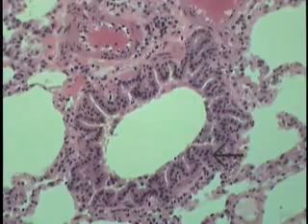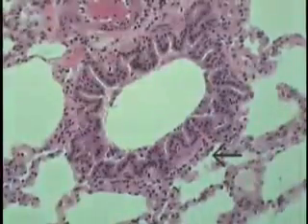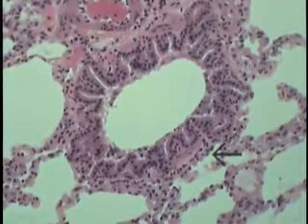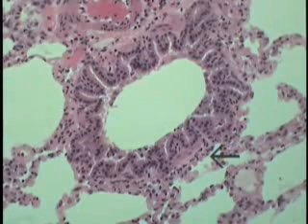The other feature to note is what is absent. The hyaline cartilage support has disappeared, the glands have disappeared, and there is very little, if any, lymphoid organ or tissue in mass present at this particular point.